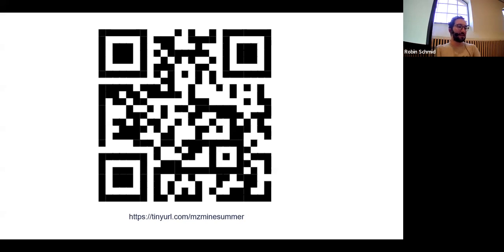Then there is the MZmine version that we just pushed yesterday, because we like to be playing it kind of last minute. So we pushed a new version 3.9.0. And if you have any previous version and you're not able to download it now in the first session and install it, that's going to be totally fine. It's going to work like 99.9%. But we just fixed a few things and made some new features even that we're going to show on the screen.